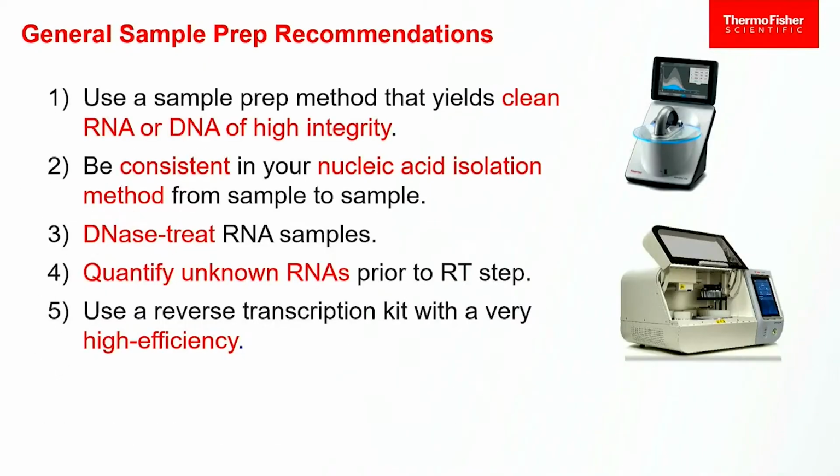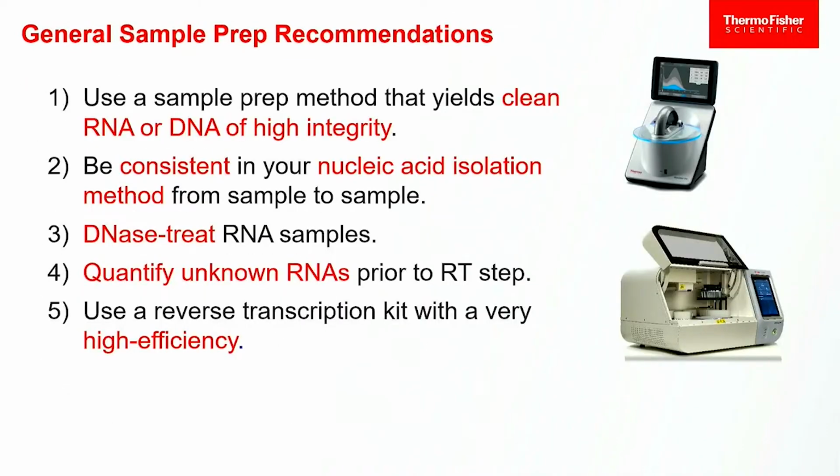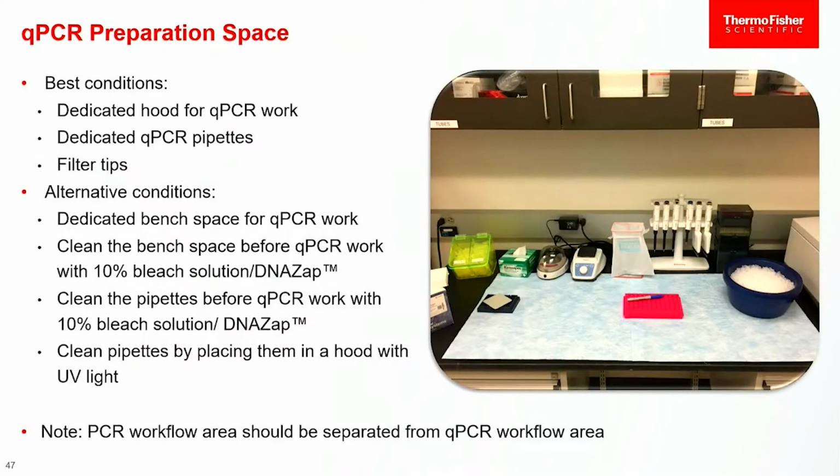It's nice to know how much RNA you're putting into your reactions, because if you put in too much, you can overwhelm the reaction and overwhelm your enzyme. So it's good to know how much goes into those before you start, and making sure you have a high quality reverse transcription reaction. Using our kits is a really good option there. Everybody uses them. Not everybody, but they're highly used. They're really good.